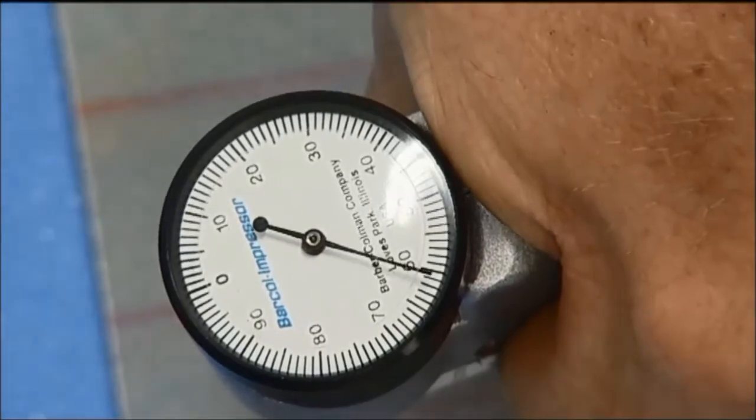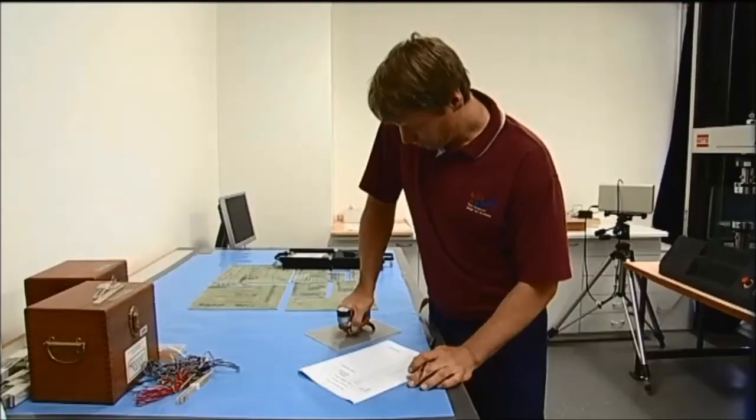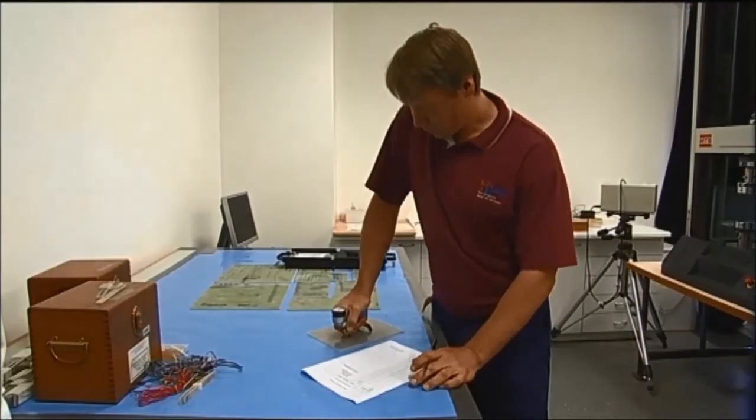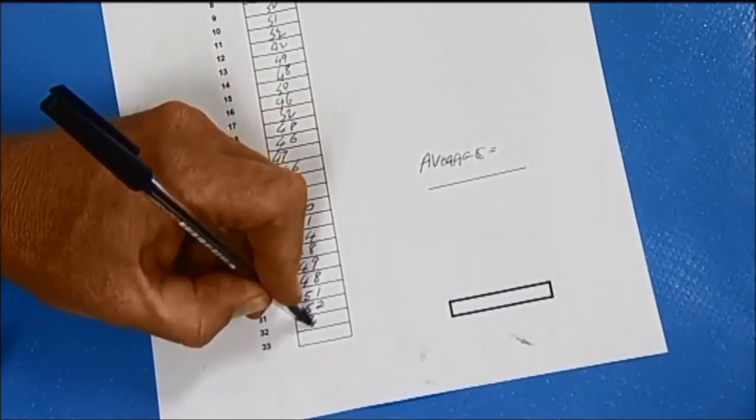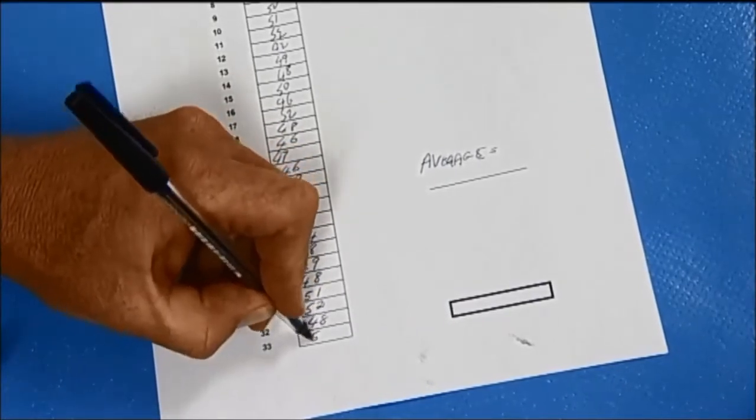The hardness of the material determines how far the tip indents and this is transferred by a tension spring and lever to be read on a dial which is converted into absolute Barcol numbers given by the instrument.